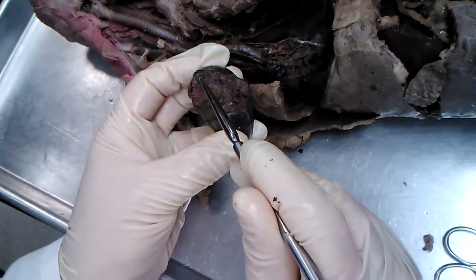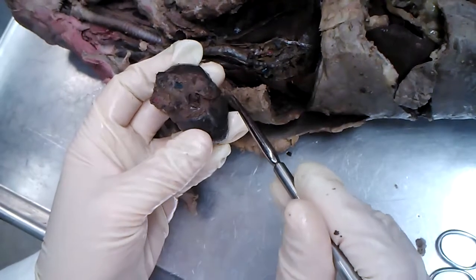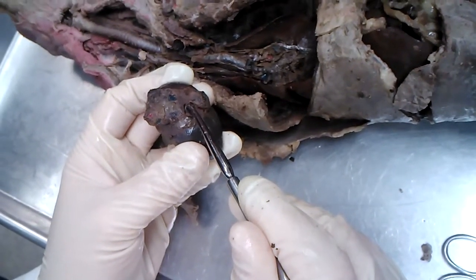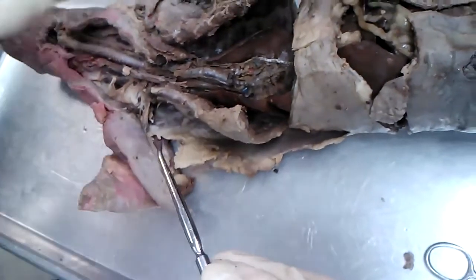This thing here is superior vena cava, aorta, pulmonary trunk. The big vein down here would be inferior vena cava. And this one vein here with a lot of clotted blood in it, that would be a pulmonary vein. Okay? So that's parts of the heart overall.